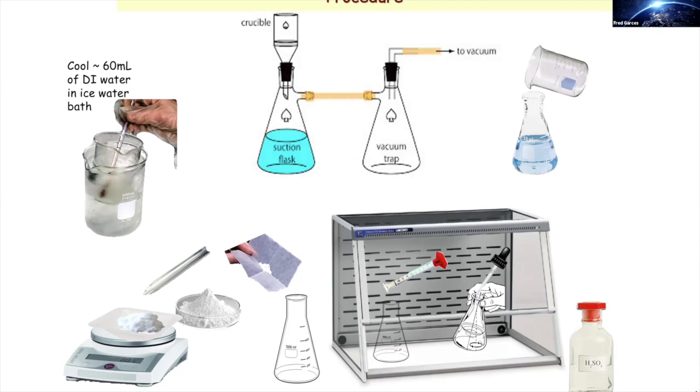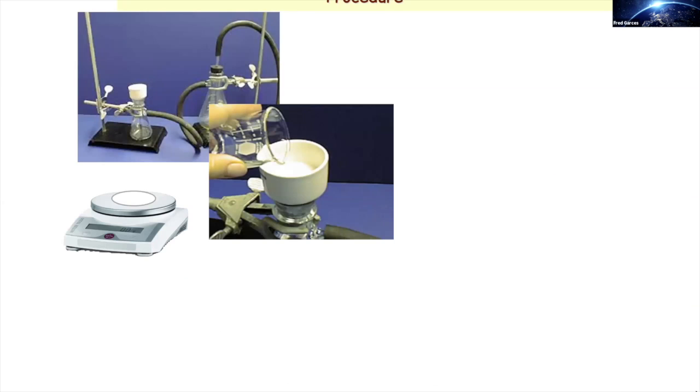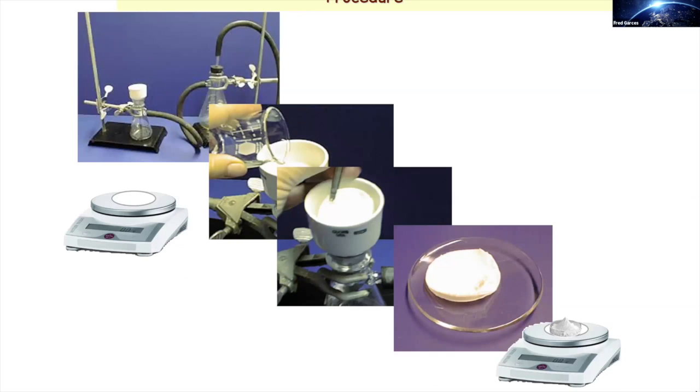And then what you do is you isolate it through something called a vacuum filtration. You guys will see this in the movie when you go further into the lab. This is the filtration process. And I would show you this if we were doing this in the lab, because you probably haven't done this technique, and it's an important lab technique when you get to chemistry 200 and also organic.